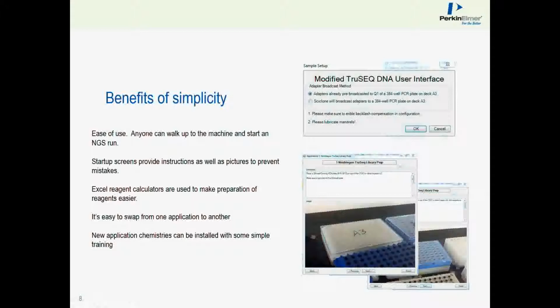All right, so we've actually set up and we've taken pictures with custom text telling the user what do you need to put in a specified position, and the caption here says place a 384 well Corning PCR plate with a certain part number on top of the temperature locator on deck location A3. Make sure to put a lid on the 384 well plate.